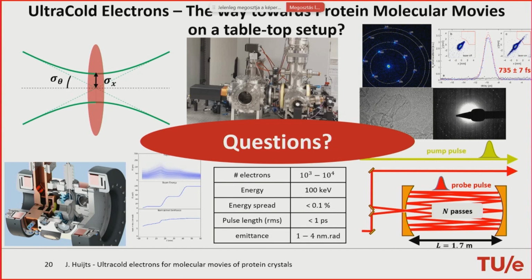I think we have tried it, and the lamella always breaks, but they have now these kind of jumping board lamellae, so they attach it only at one side, and then it tolerates temperature changes and also transport much better. Oh, so it's practically open. It's not a closed lamella. It looks like when you're at a swimming pool and you jump in. So it's looking like that.